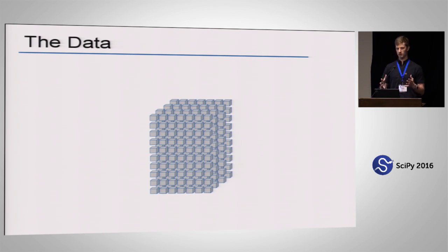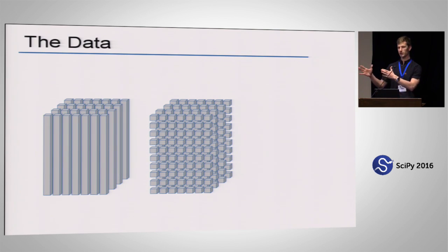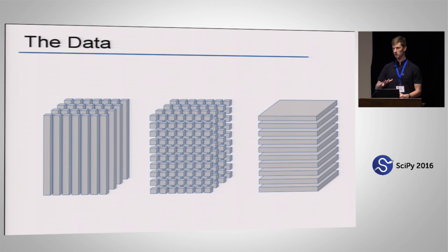However, the intuitive way to think about the same data set, exactly those same dimensions and numbers, is the way we measure it, as a rectangular array of spectra, right? Yet another way to look at this sort of data is like a stack of images. The best example of that would be any movie. All the frames would be in 2 dimensions, and then as you go along the time, you stack the images, right? So any movie is essentially a 3-dimensional cube.